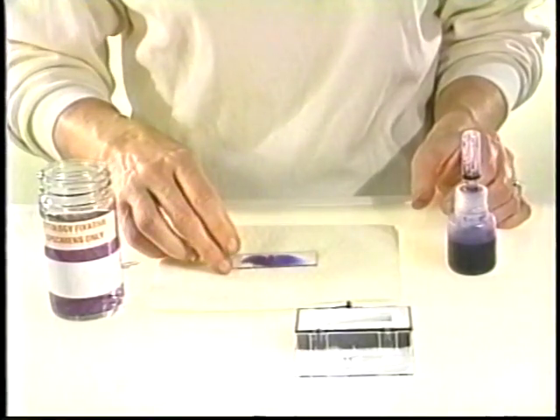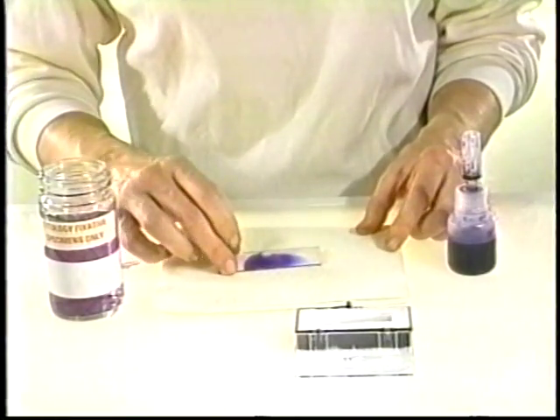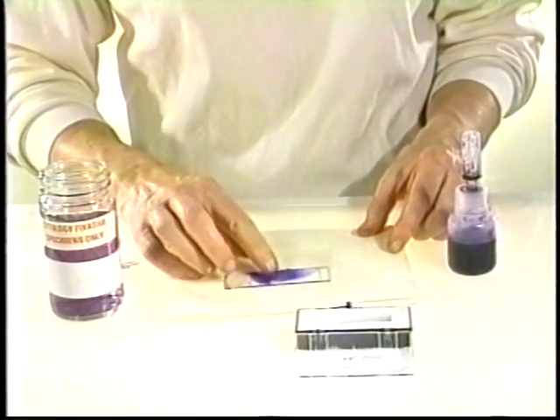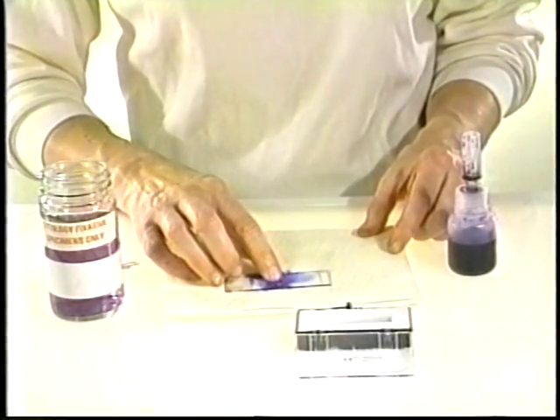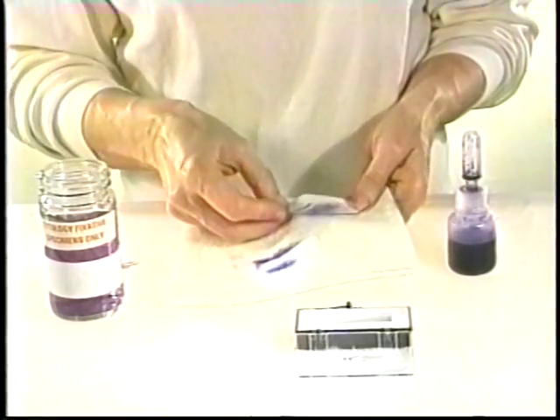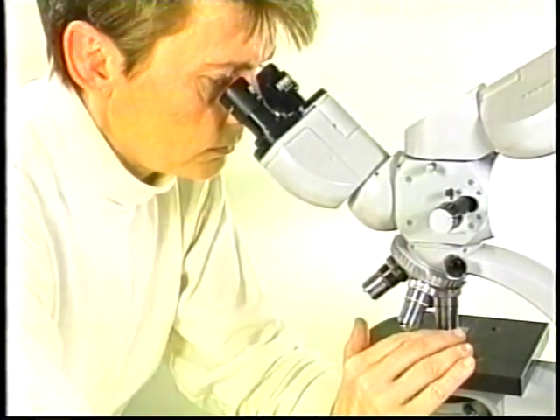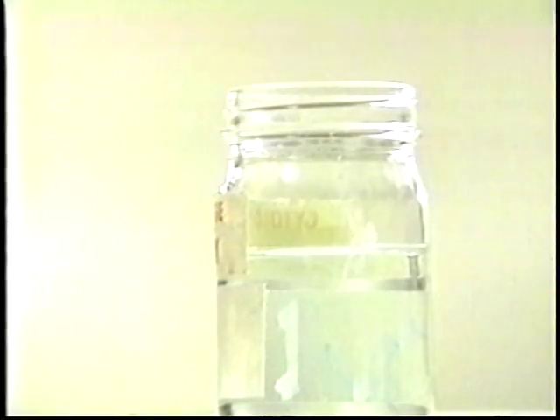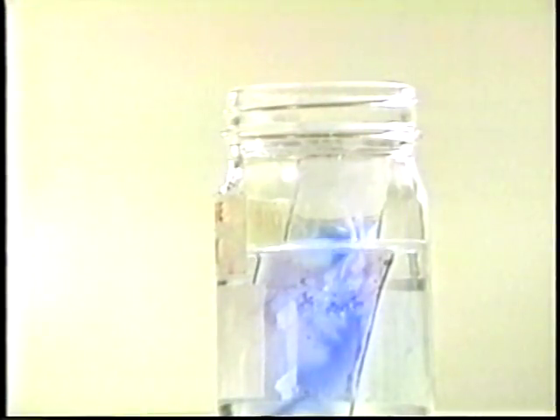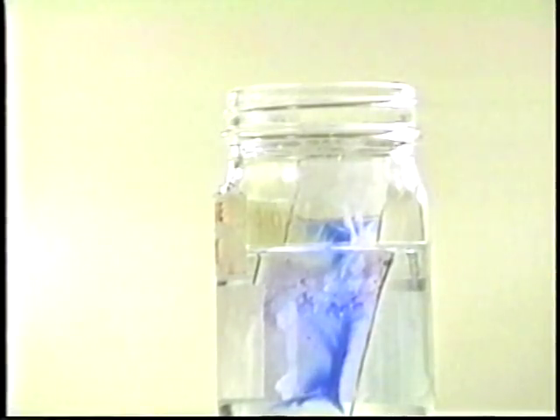I let the stain penetrate for about 15 seconds before removing excess stain by turning the slide and pressing gently. After wiping the bottom dry, the sample is ready for examination. After evaluation, the slide is returned to the alcohol container. The cover slip will fall off and the stain dissolve. The slide will be restained with Papanicolaou for final evaluation.